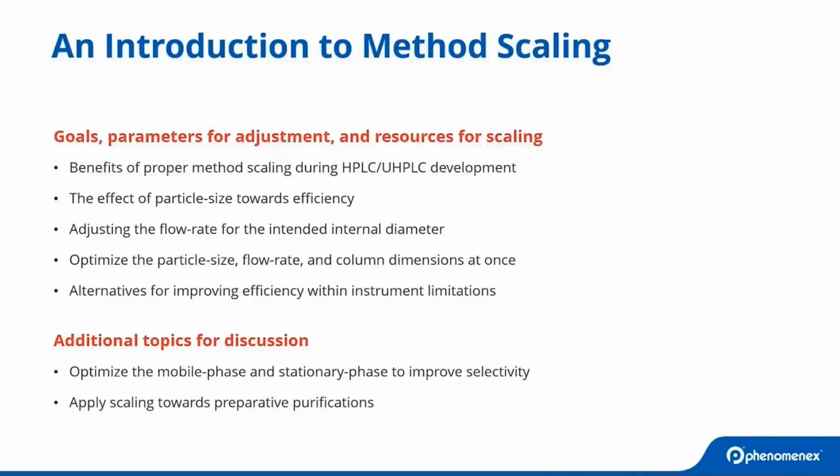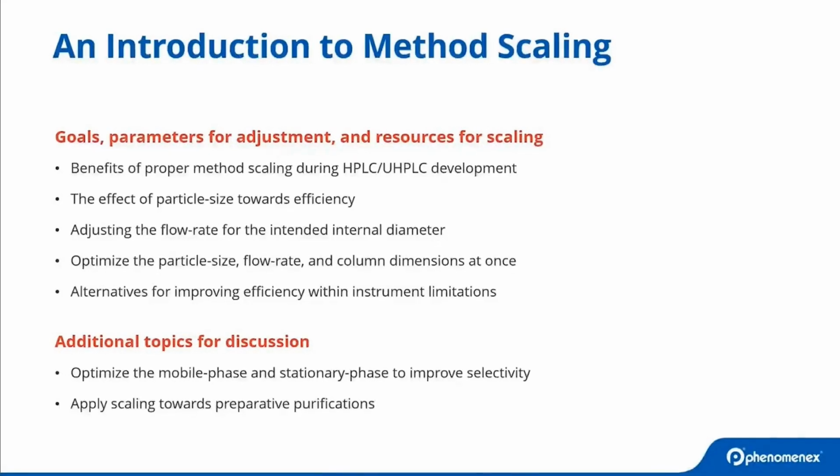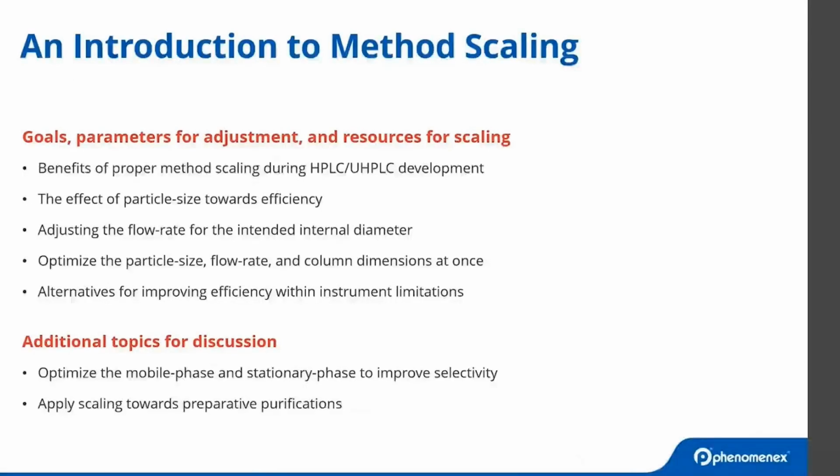Later on, when we have a moment for questions, we can perhaps elaborate on these topics as they pertain to ideas regarding stationary phase selectivity, or perhaps even scaling upwards towards preparative purification methods.